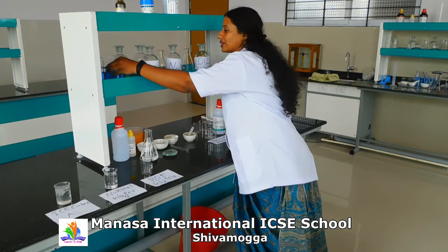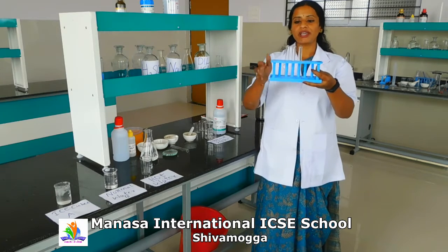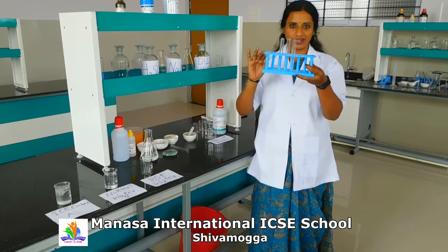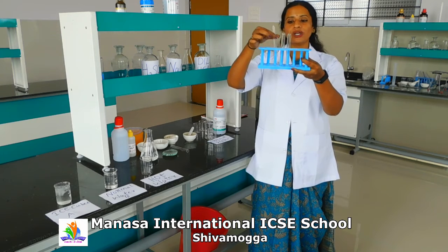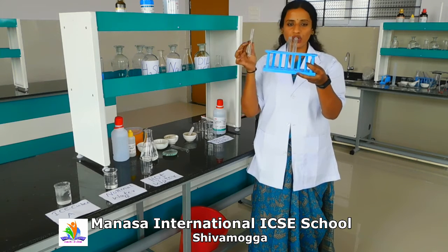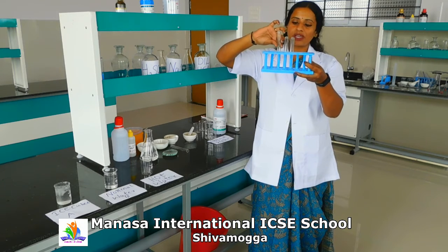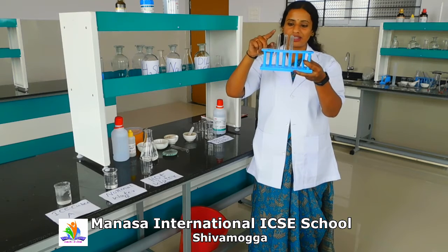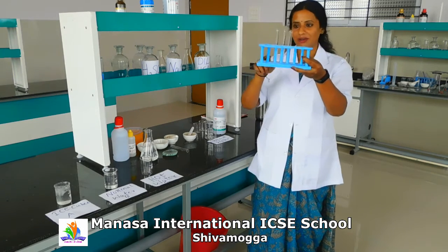Next we have the test tube stand. Test tubes can't be kept as you keep vessels in the kitchen. They have to be systematically arranged, and this is what is known as the test tube stand. Always after performing any reaction, the test tube has to be washed and then kept inverted so that any water or liquid comes out of it. This is called the test tube stand.